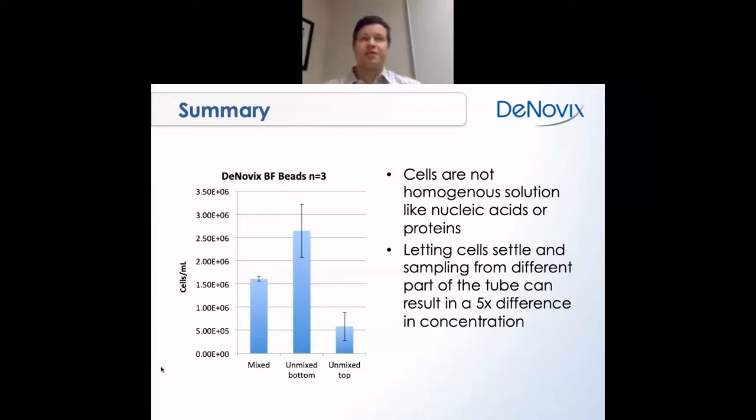So this is one of those things that might seem obvious to people, but I think that a lot of times it can have more of an effect than might be realized. Make sure that you're really mixing well and loading your cells onto the hemocytometer right away after the mix is done, and not getting distracted.